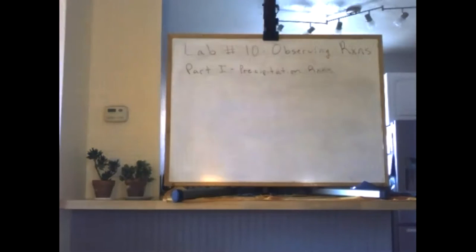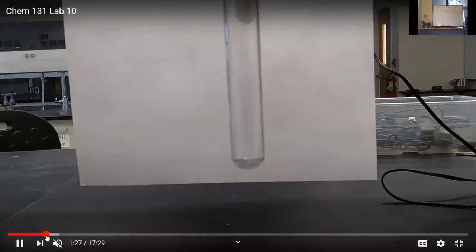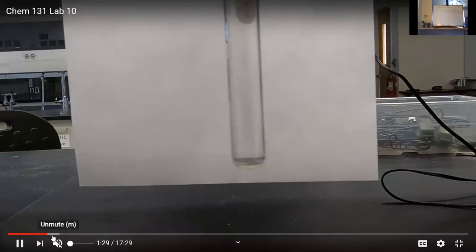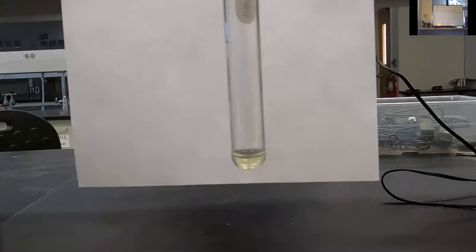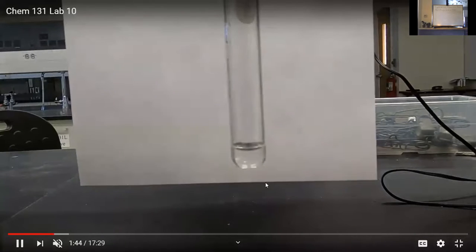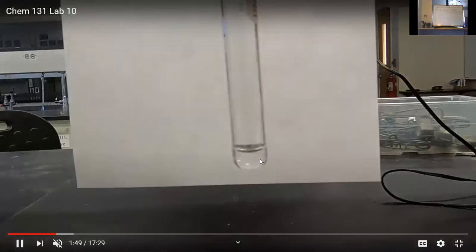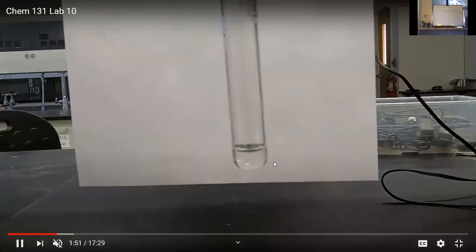We keep going through. The next reaction will be potassium iodide with sodium sulfite. Does it look like a precipitate is formed? Do we form a solid? No, doesn't look like any precipitate formed, right? So that would be no reaction.